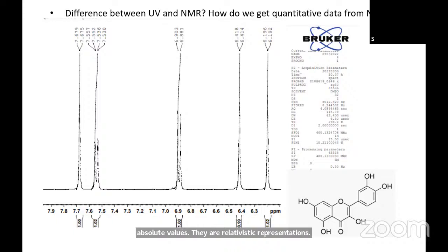So that is the reason why we require an internal standard. Internal standard is almost essential in quantitative estimation of any compound by using the qNMR technique.